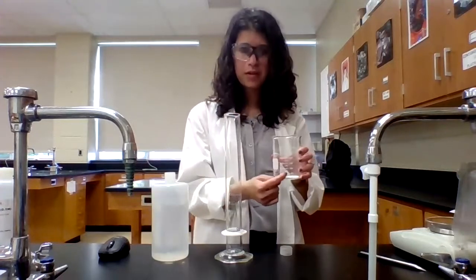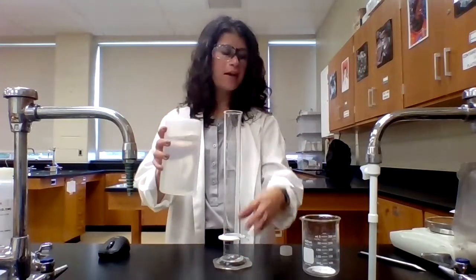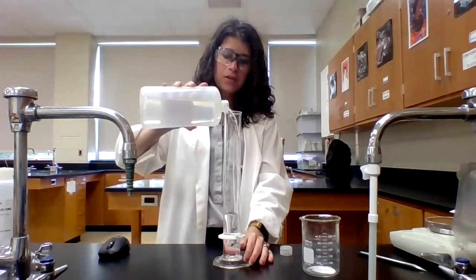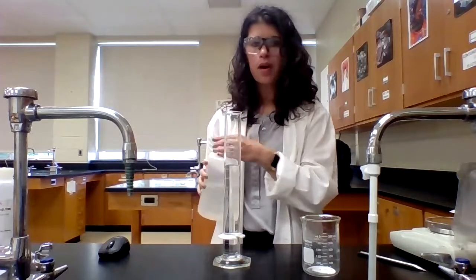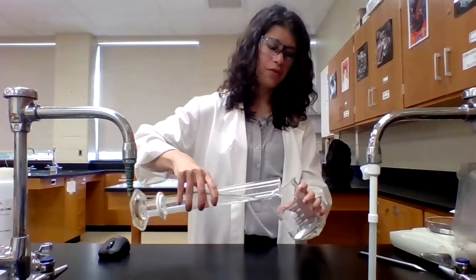Now, yes, beakers do have volume markings, but a beaker is not a precise enough way of measuring volume. We really never use beakers to measure volume. We always want to use a graduated cylinder or pipette or burette, something like that. Never a beaker or an Erlenmeyer flask when we're measuring out a volume. So I'm going to add approximately 200 milliliters. The exact amount of water is not important, just enough that it will dissolve.